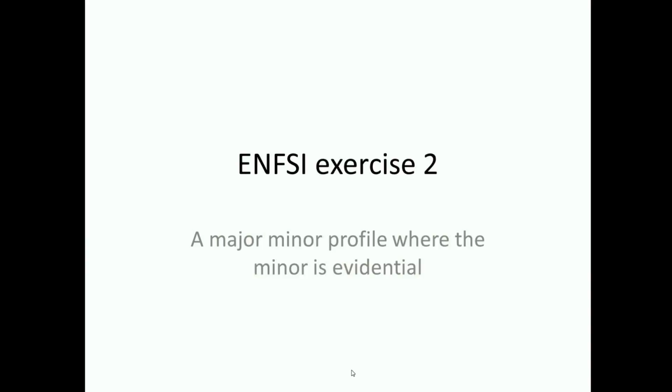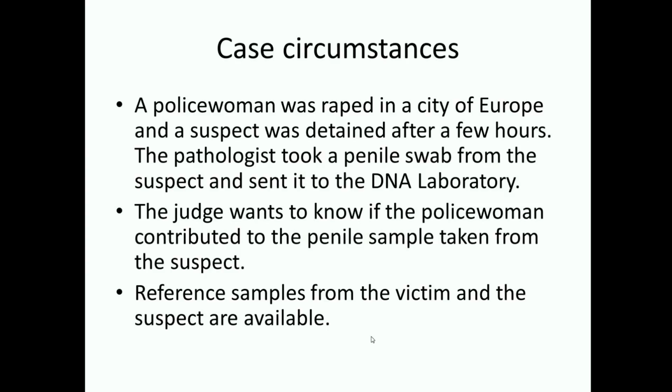Now I'm going to discuss ENFSI exercise 2, which is a major minor profile where the minor contributor is evidential. First of all, we look at the case circumstances.